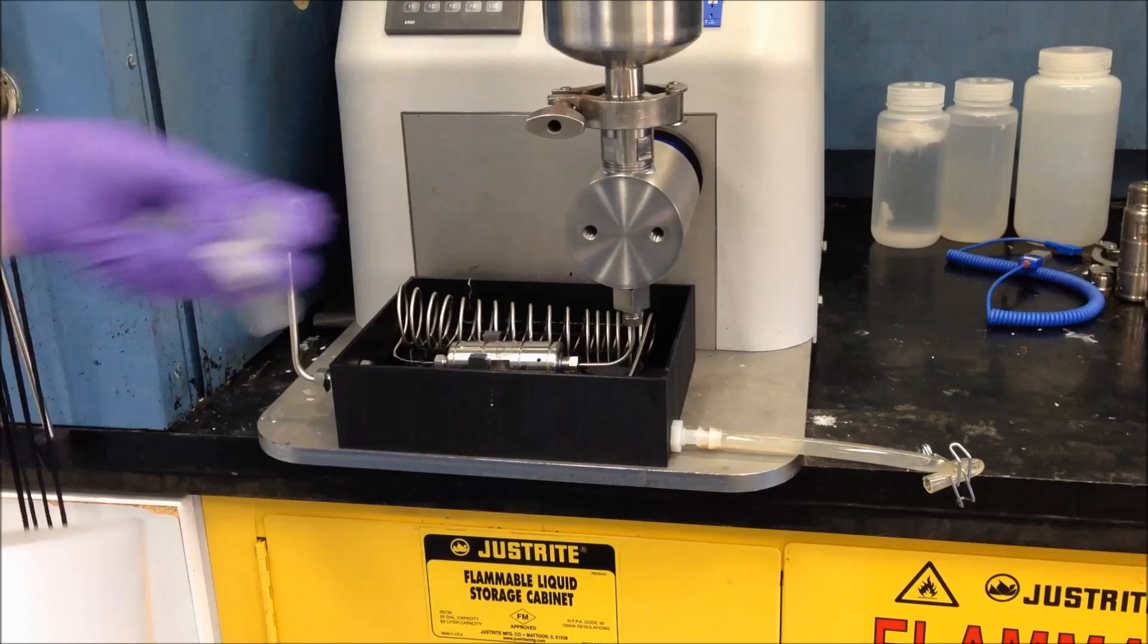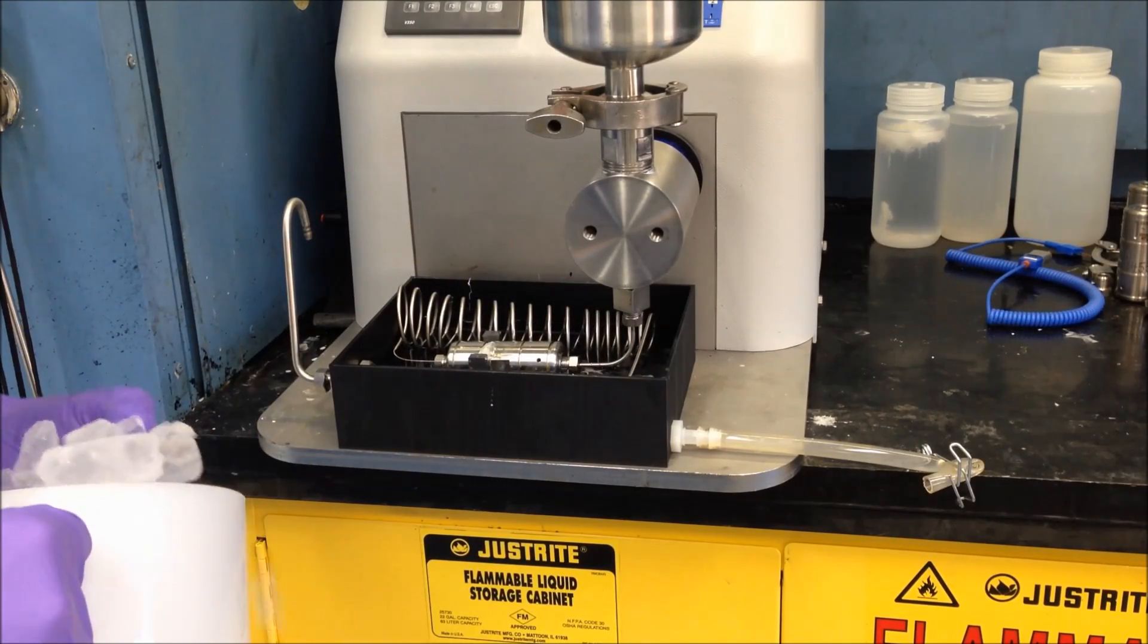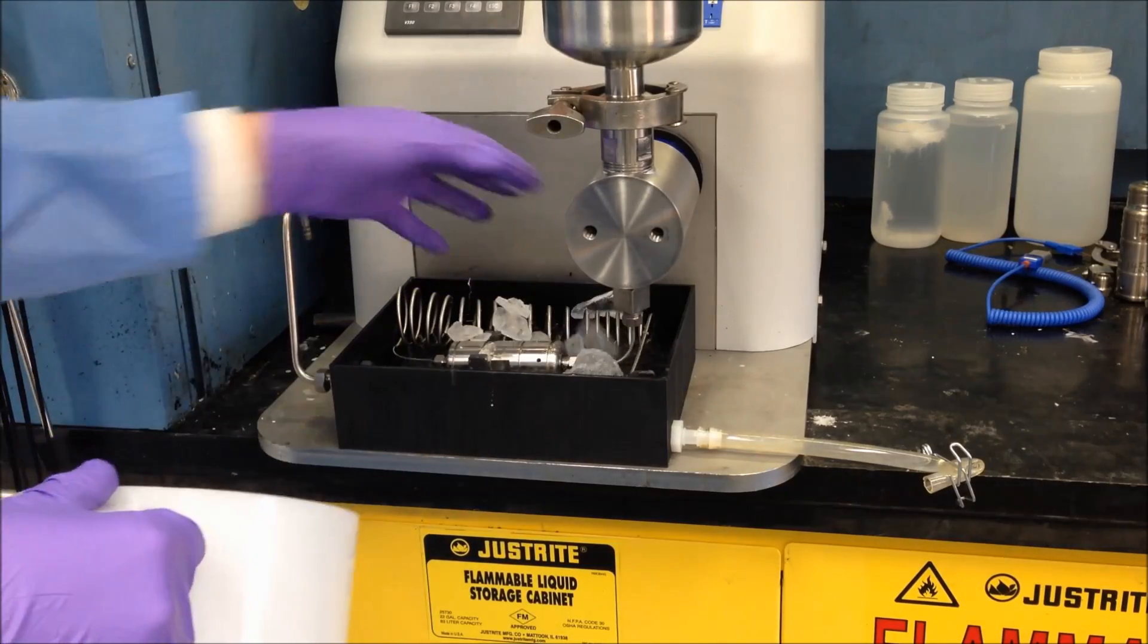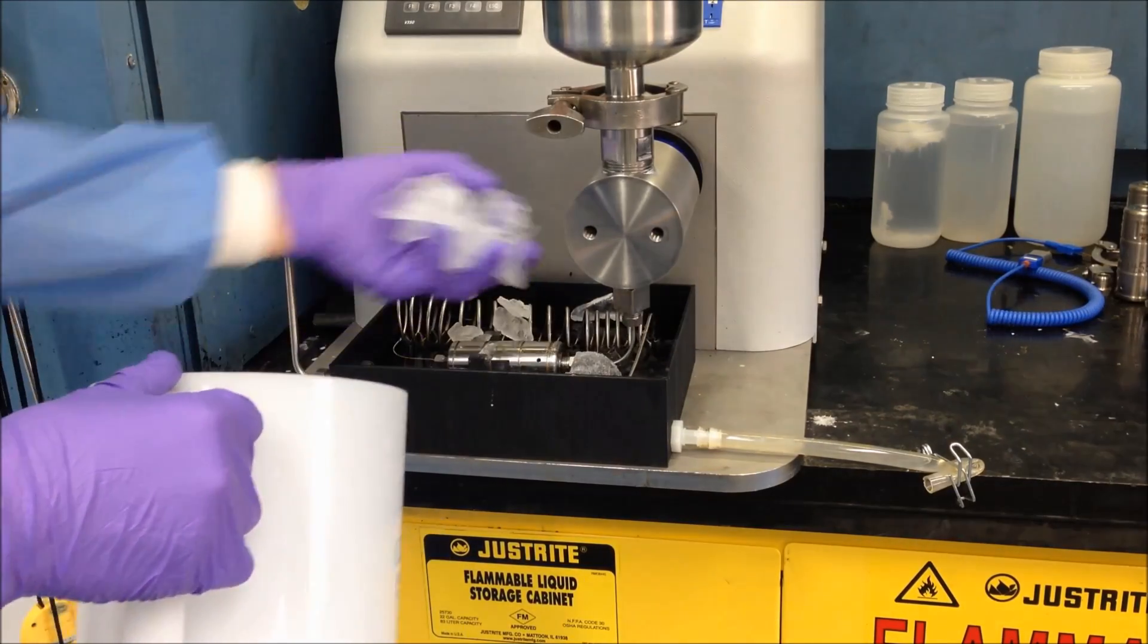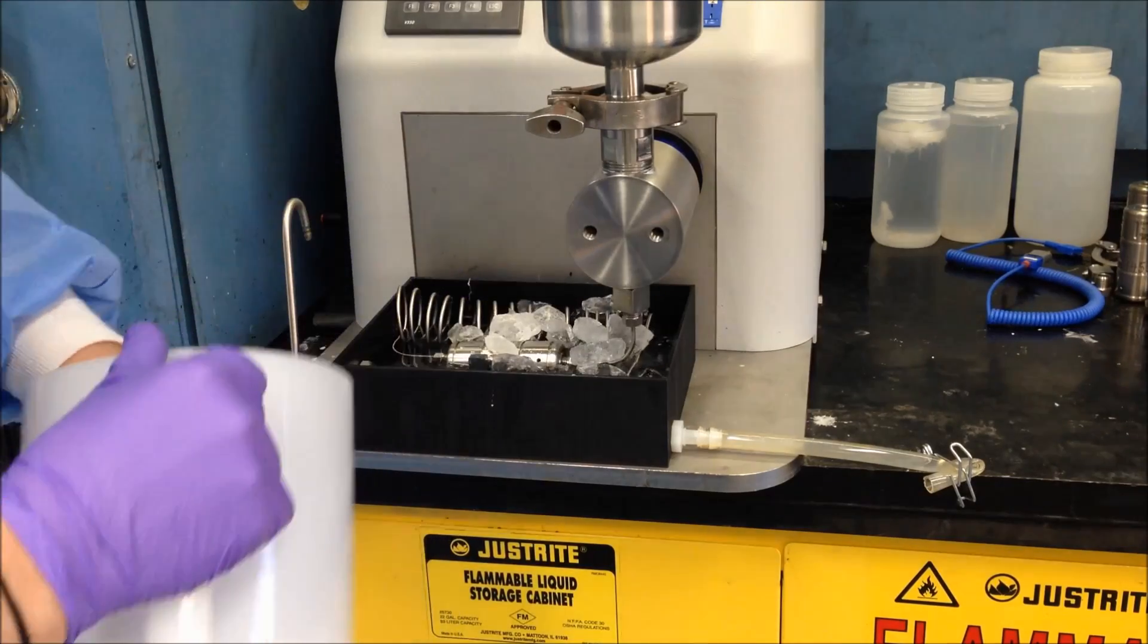While the water phase is cooling, the microfluidizer can be prepared by placing ice in the cooling tray. This will help ensure that the dichloromethane does not evaporate during processing.